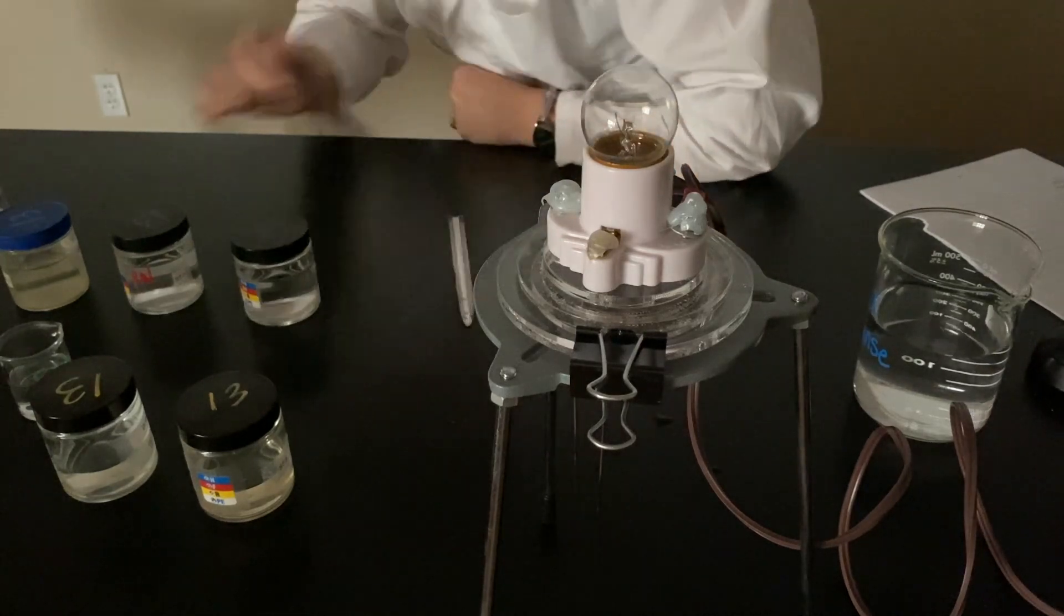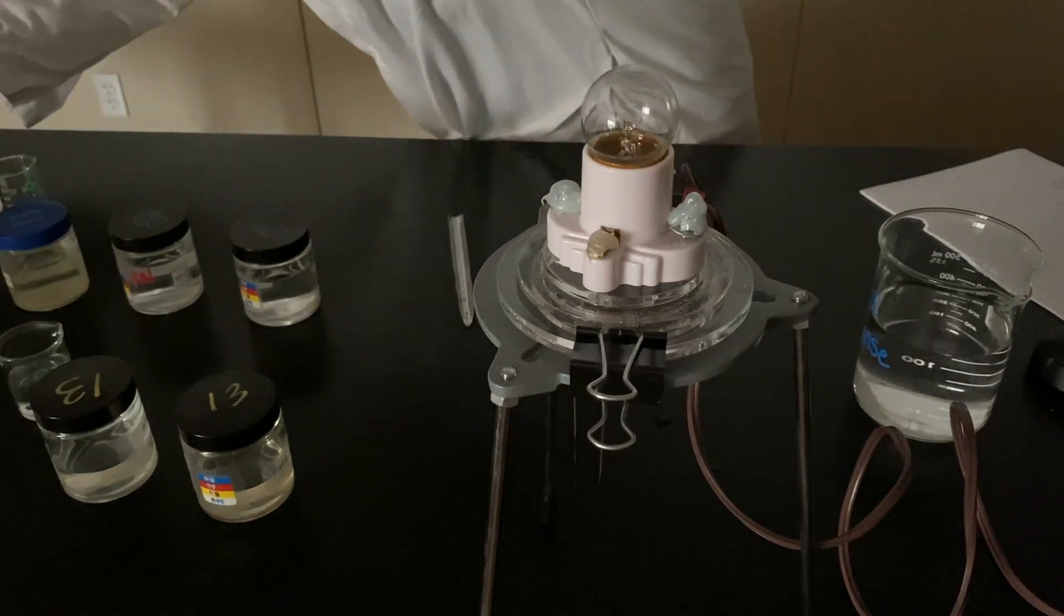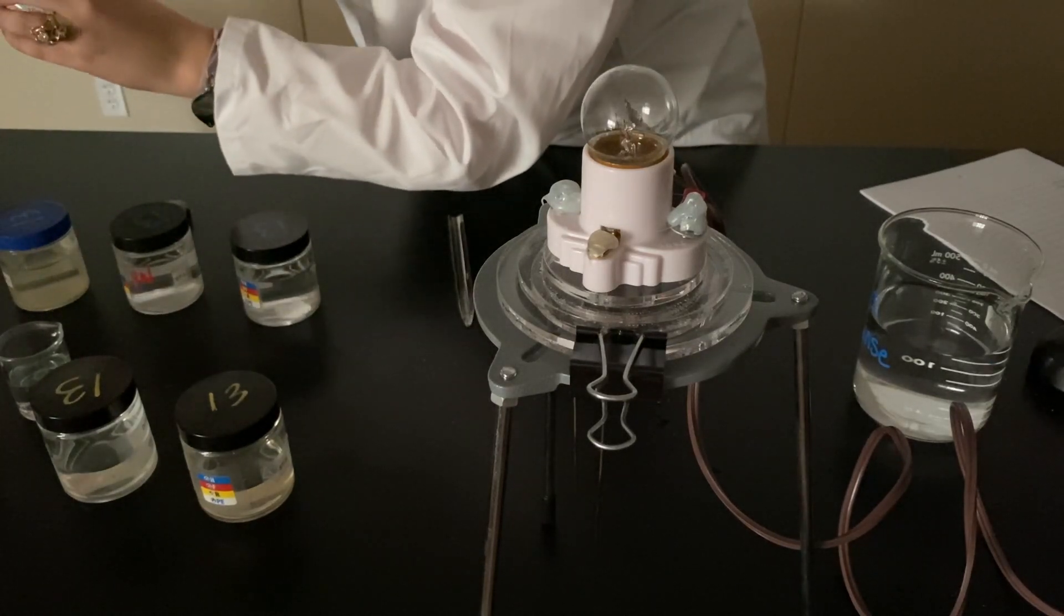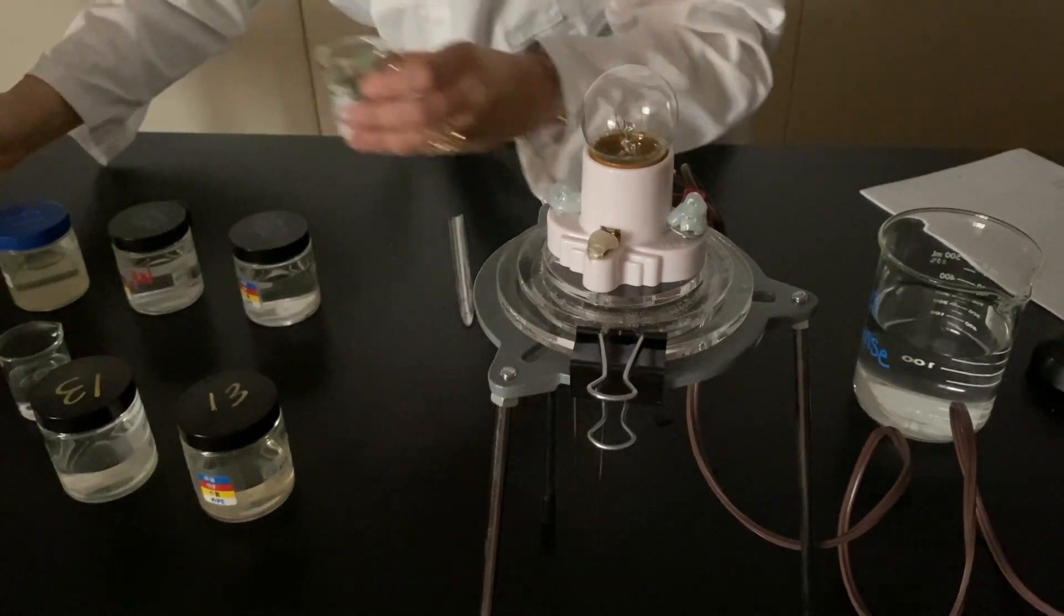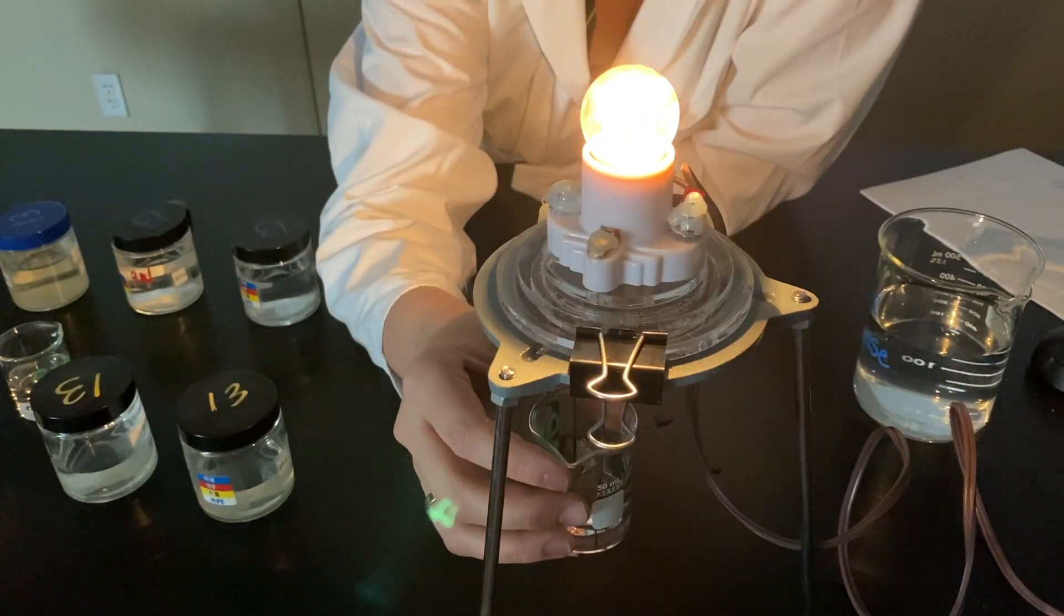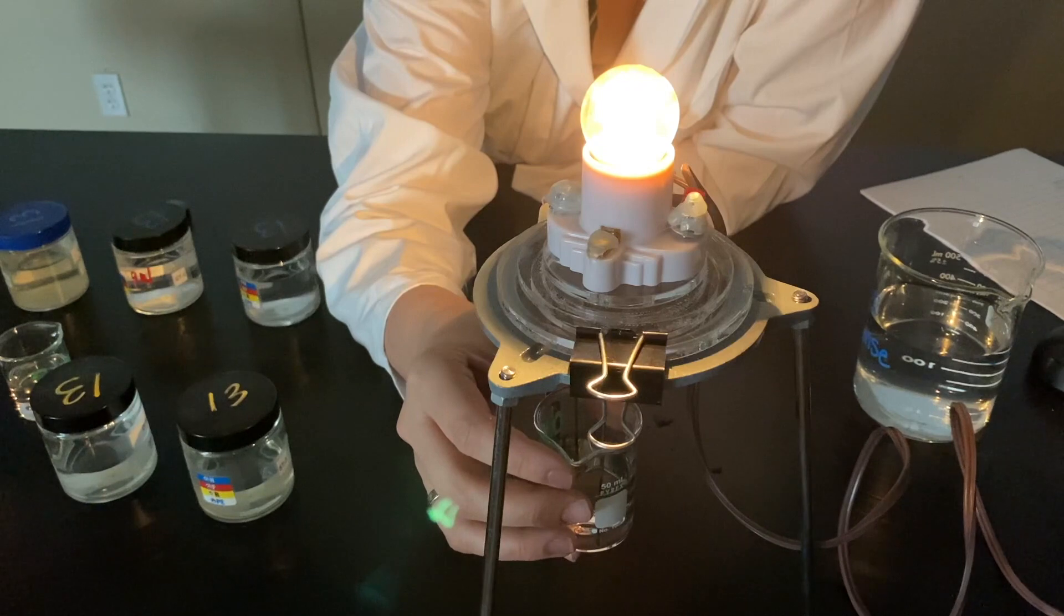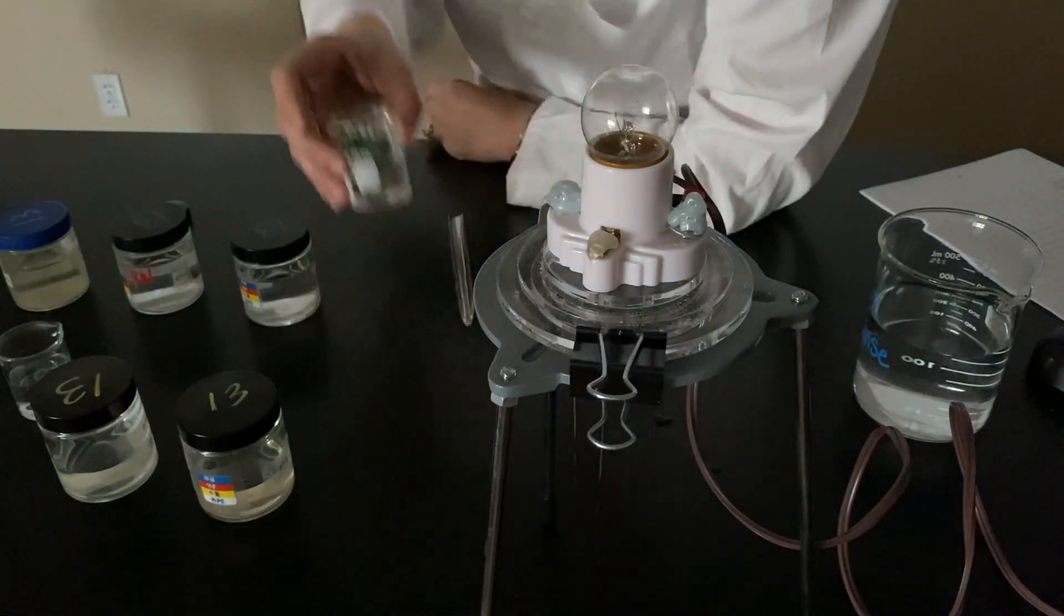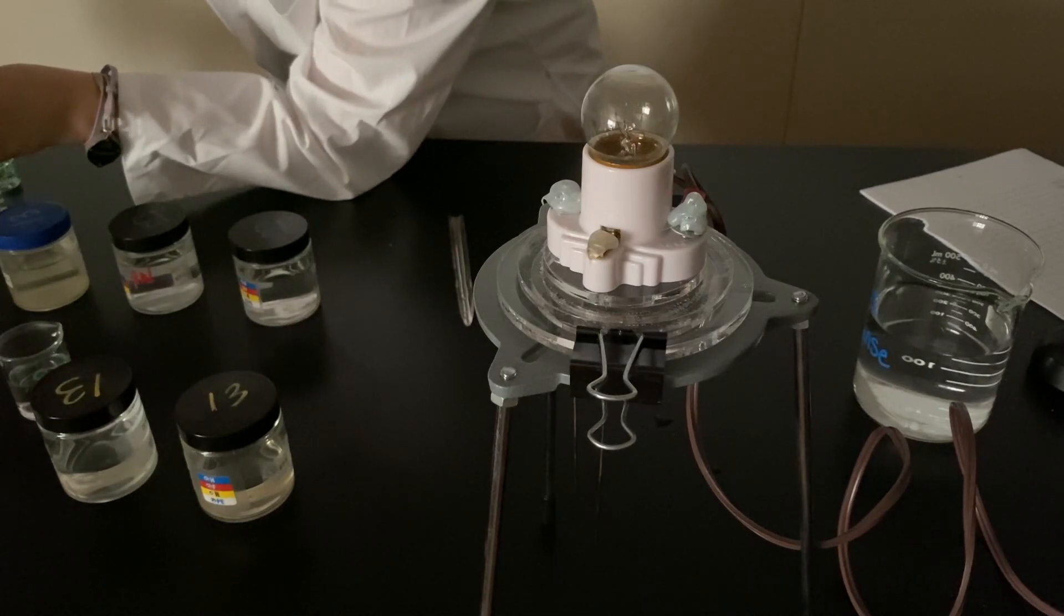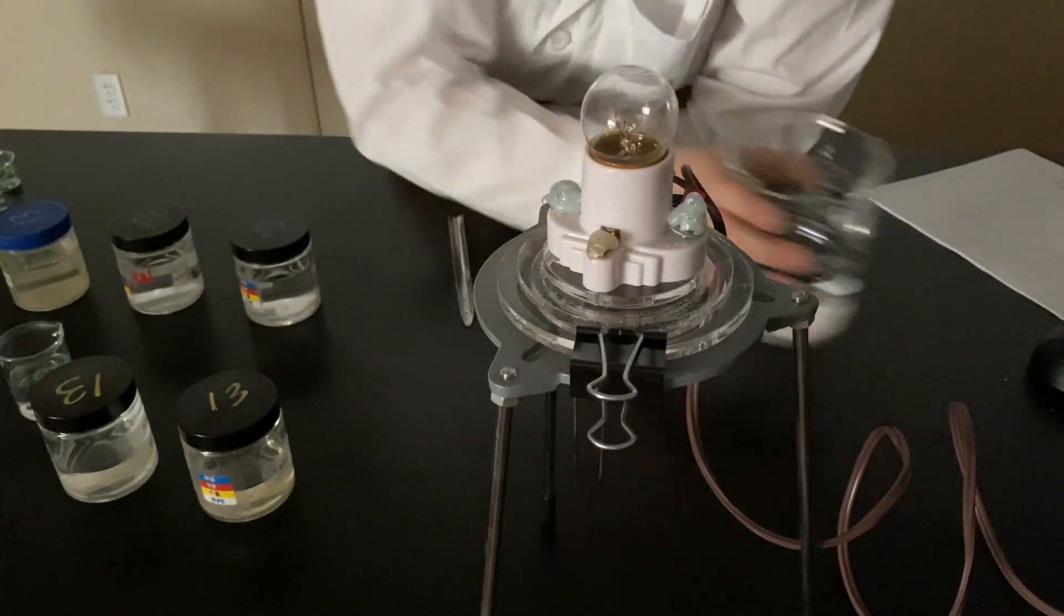All right. Then we get 0.1 molar phosphoric acid. Why did I not have this poured out already? My bad. Here we go. Phosphoric acid, 0.1 molar. Okay, so 0.1 molar. That's not very concentrated. We still see it lighting up. DI rinse.